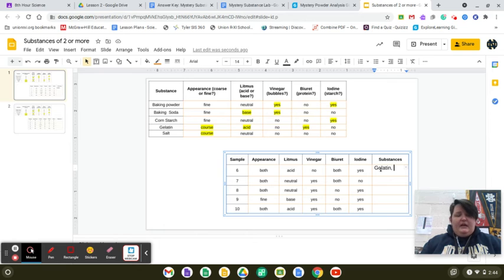Gelatin, which we already know we have, gives us the coarse. So the other one has got to be a fine one, and it's going to be one of these 3 right here. That will help us a little bit further down the road.